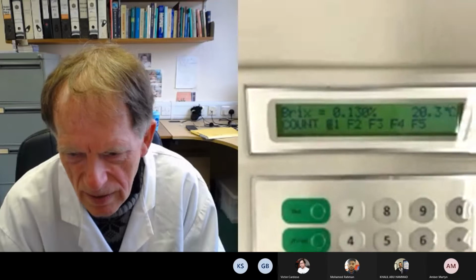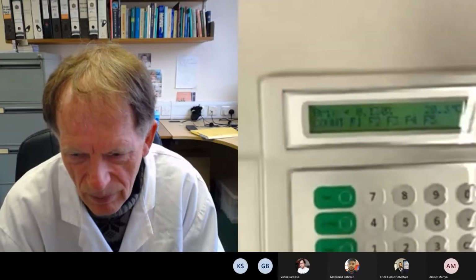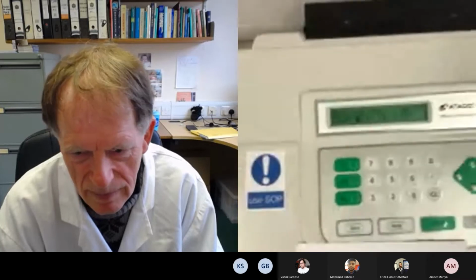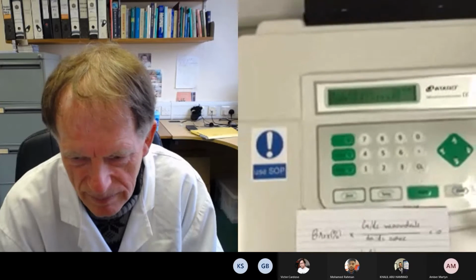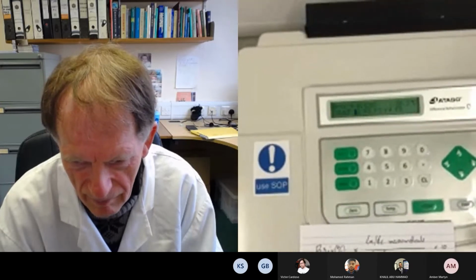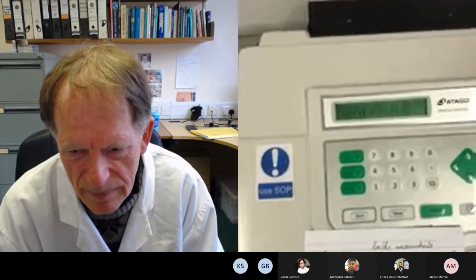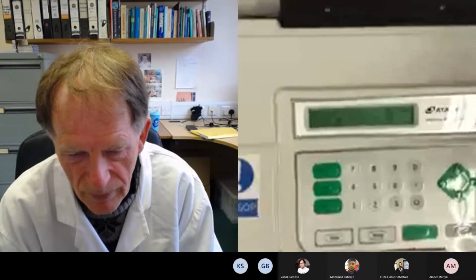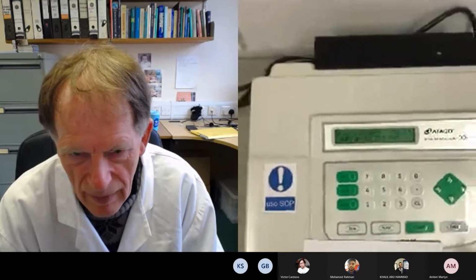Right. Okay, that's different from the diluted Thomas sample you were looking at? Yeah, so that is slightly different from the spectrophotometer, and I think that is because there are other things in there which don't absorb. Is that true? Yeah, that's right. So that will tell you the concentration of all the material in there. Okay.